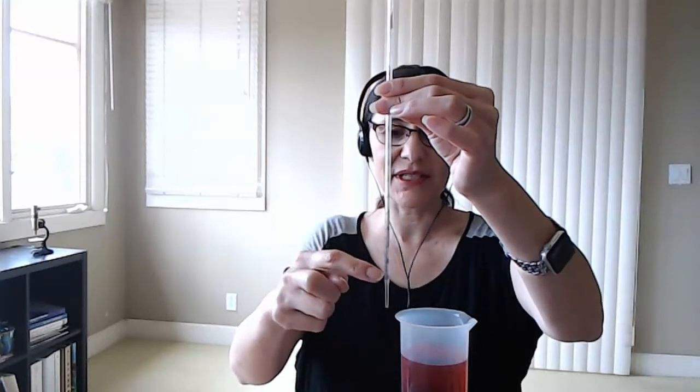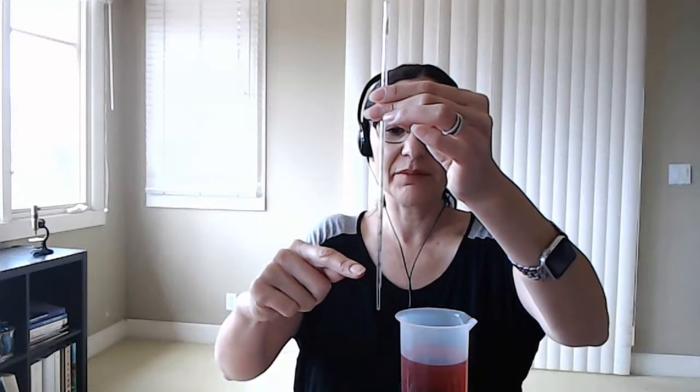You don't want to touch the tip with your hands. We can also see that the 1 ml pipette has the cotton plug there. With the 1 ml pipette, we are measuring volumes in increments of 0.1, and this one only has the graduations listed as we would use them in science. So it would be 0.9, 0.8, 0.7. It's not listed 0.1, 0.2, 0.3, 0.4.